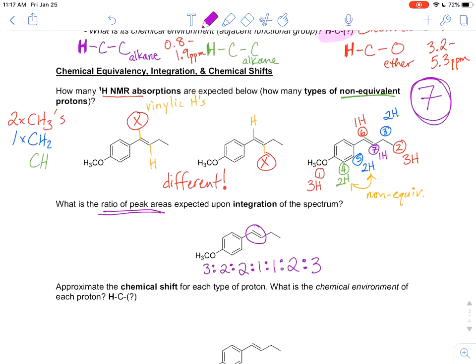Now, we fill in this last thing. So this is the other way to get to 7 types of hydrogens. We said that there were 4 CHs, and that was the way that we did this in lecture, that we got a total of 7 signals.